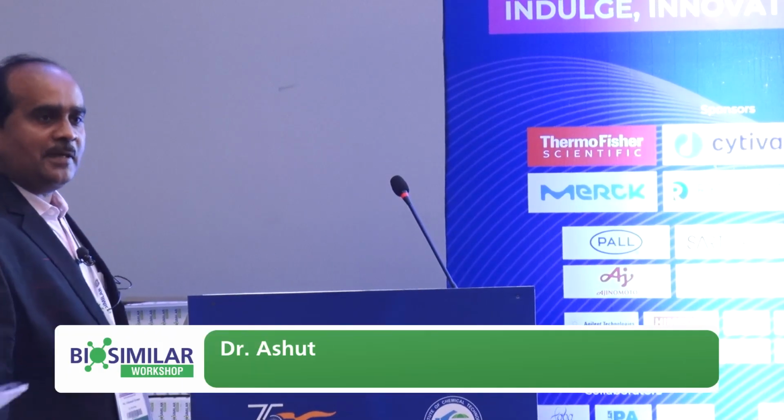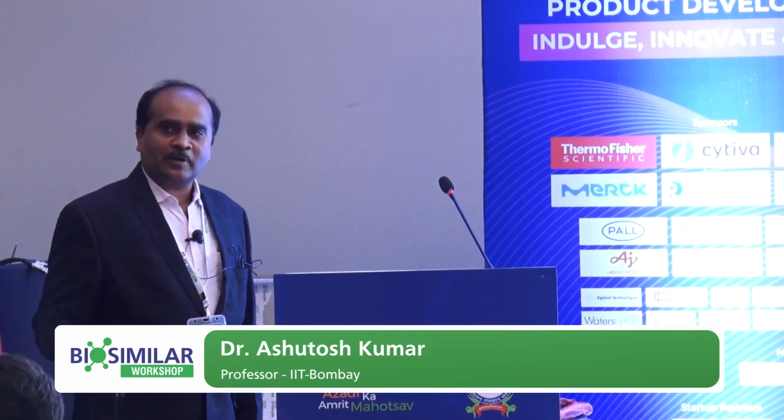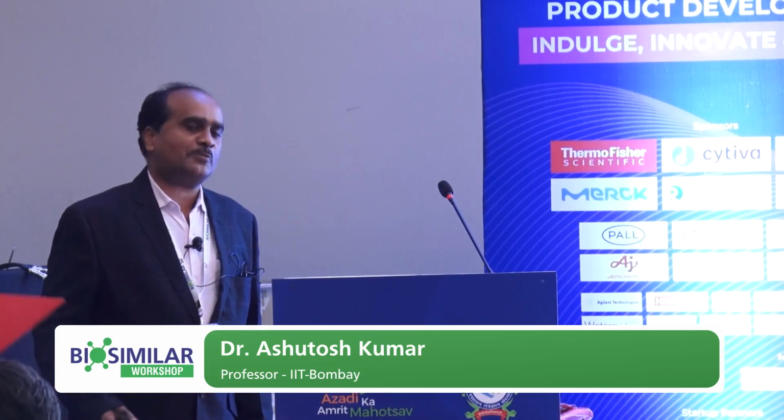Thanks, Navratna, for introducing me, and thanks Ratnesh and his team for organizing this wonderful meeting in a wonderful setting, right? It's just on the beach. Today I'm going to show you what we are doing using NMR spectroscopy for in-formulation state, higher order structural characterization of biopharmaceuticals.